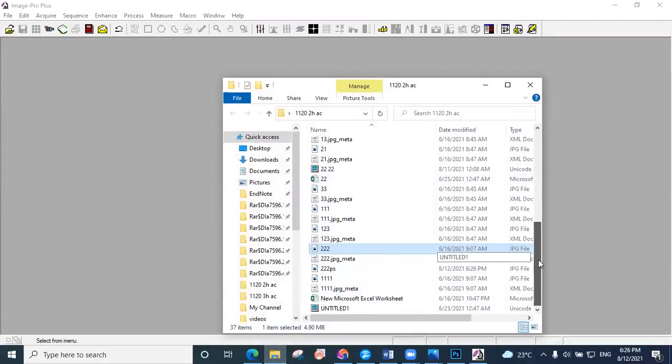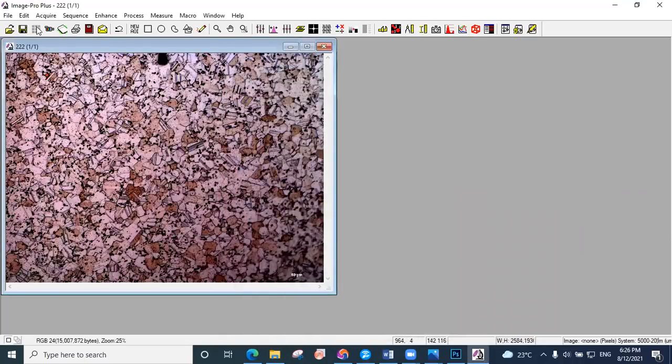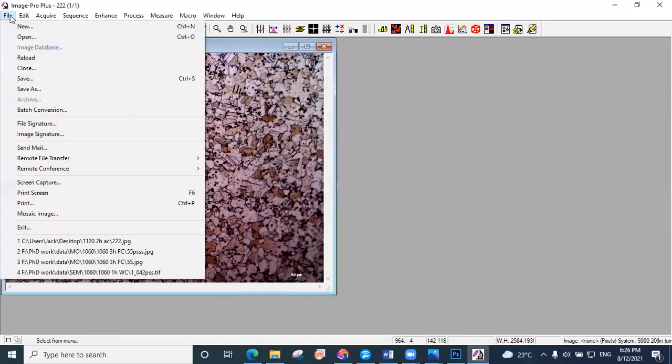We now have the original picture and we have the BS that we have determined the size. So take the original one and drag it to the app, and wait, or you can click here, open and choose the picture.